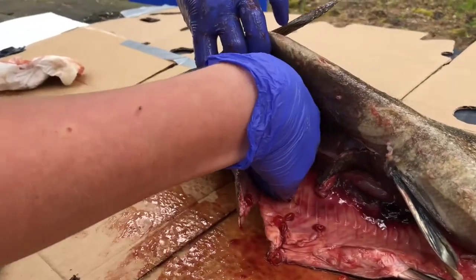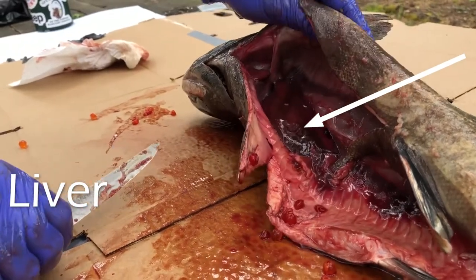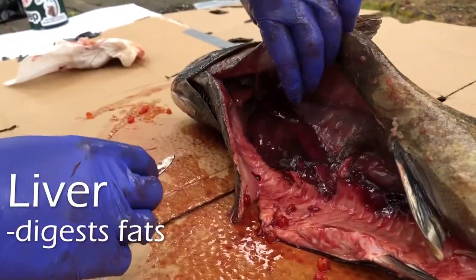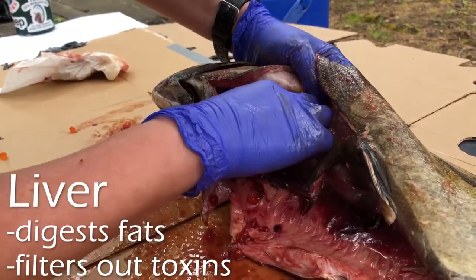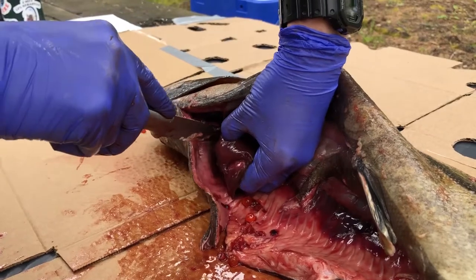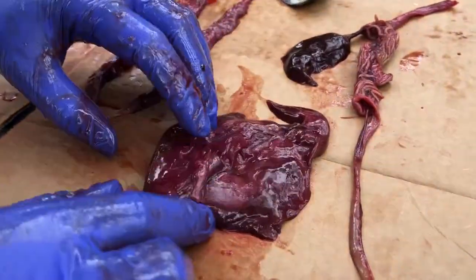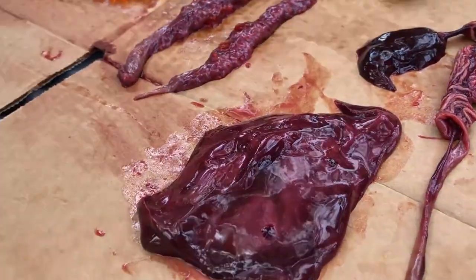Next in here we've got this big organ — this is the liver. The liver's job is to digest fats; it's also part of the digestive system. It is also important for maintaining blood chemistry and filtering out toxins. It's quite dark red because it's full of blood.